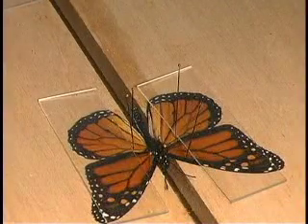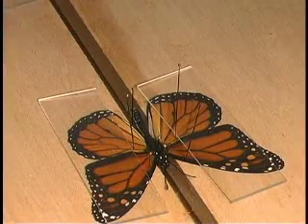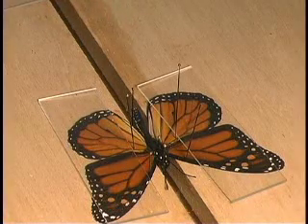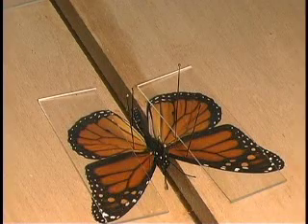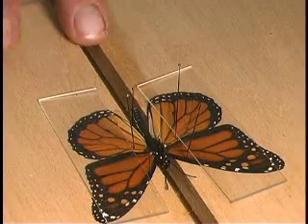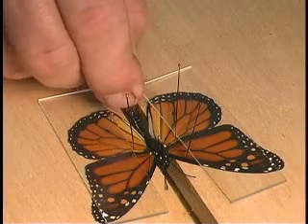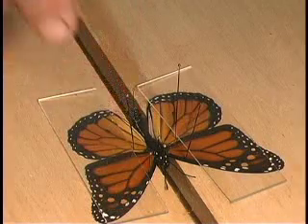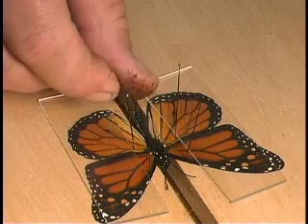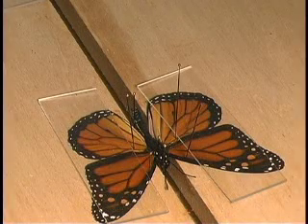Okay, when you're inserting the butterfly, the Lepidoptera, into the mounting board, you push that specimen down into the groove far enough until the point where the wings are actually inserted on the thorax are perfectly even with the edge of the board. And also, when you're positioning the abdomen, make sure that you position it not by pinning through the abdomen, but by supporting the abdomen, or just moving the abdomen by placing a pin either underneath of it or to the side of it and moving it from one edge to the other.